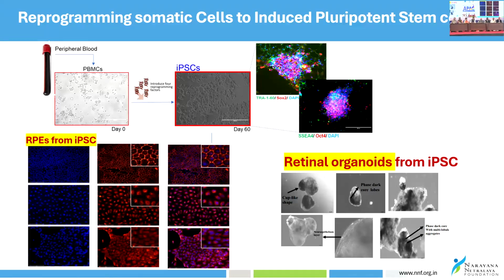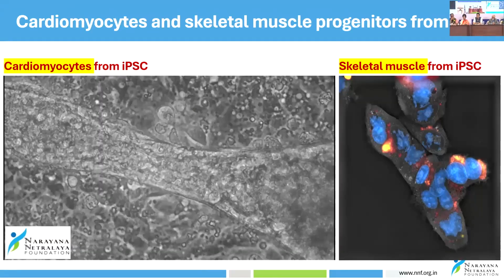So instead of trying multiple drugs in model animals, you take that whole organoid, grow the cells from the same retinoblastoma or melanoma, any cell lines, and try different drugs. Gagan was working on it. Yes, that's right. And then see which one of these drugs works. Organoid-based research to create models is a fantastic model of human diseases. I think disease modeling, as well as pharmaceutical screening before we take it to the animals and further.